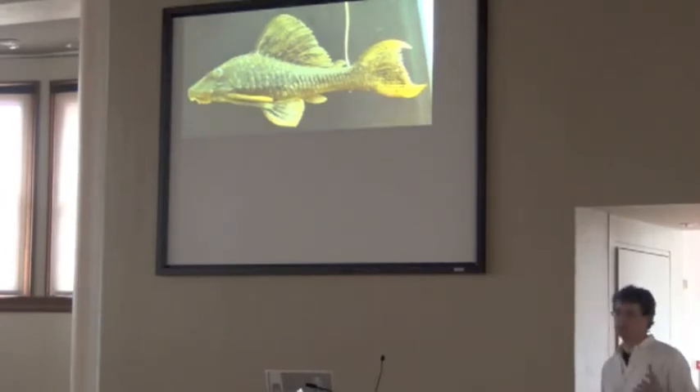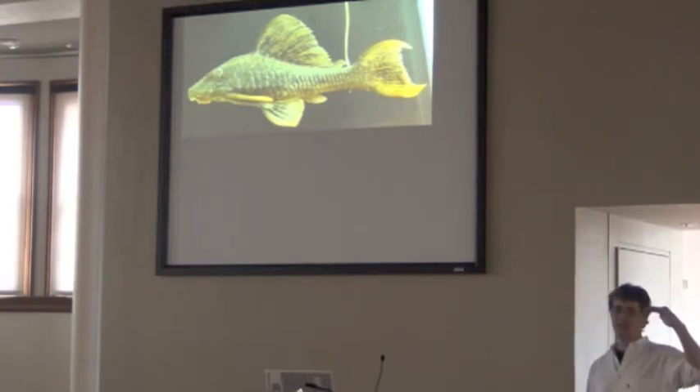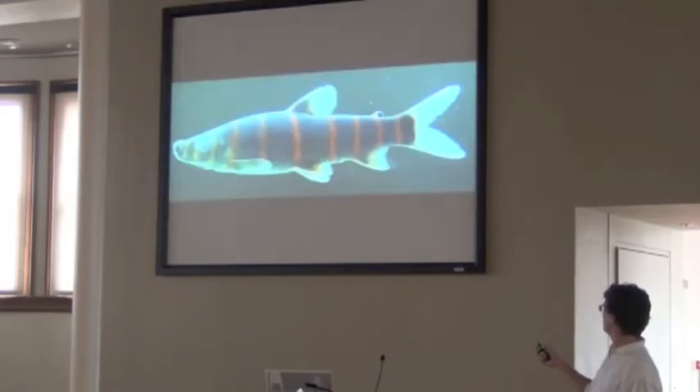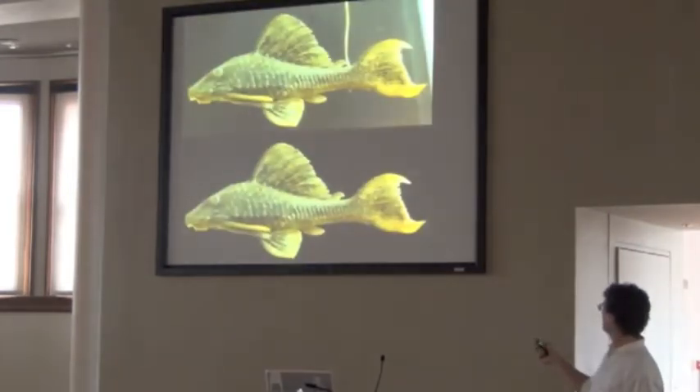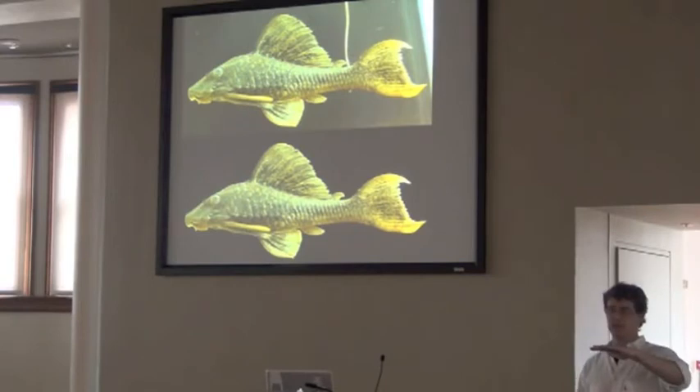Just some tips for taking pictures of fishes in the field. This is a big, large area specimen and I had trouble getting it to sit nicely in my tank, so you bring a little tool to prop it up and then take your shot. You want that perfect lateral view, and you bring little tools like this in to help achieve that.